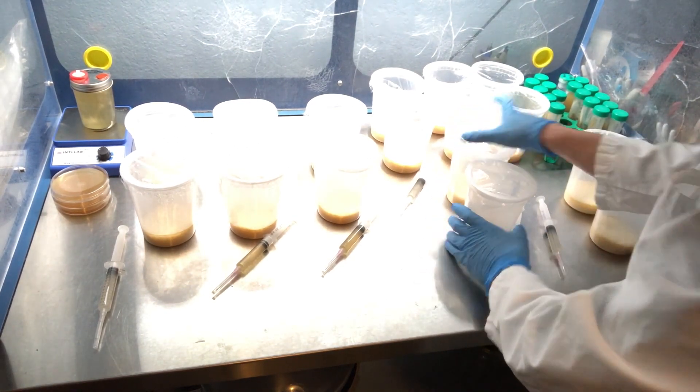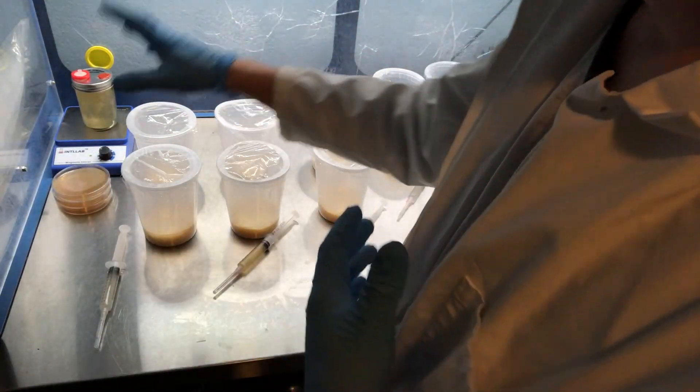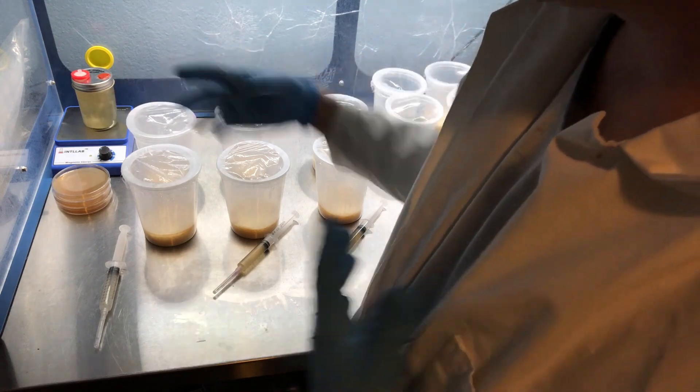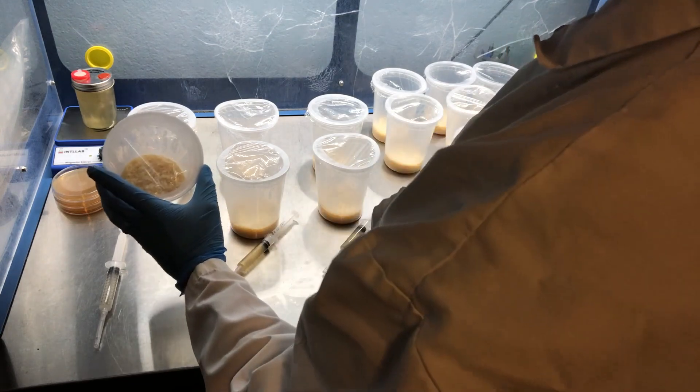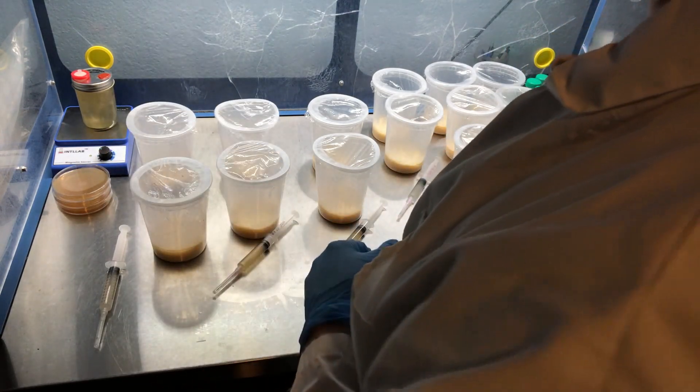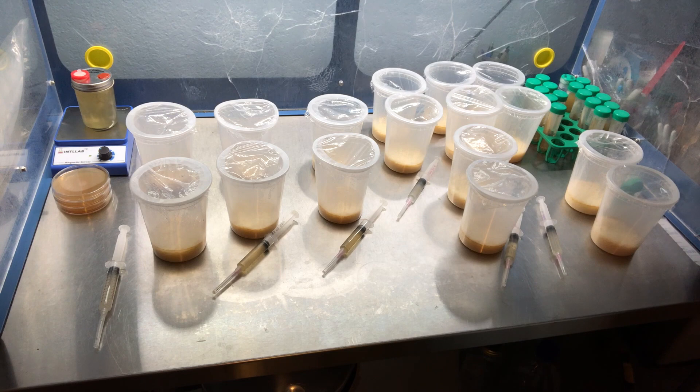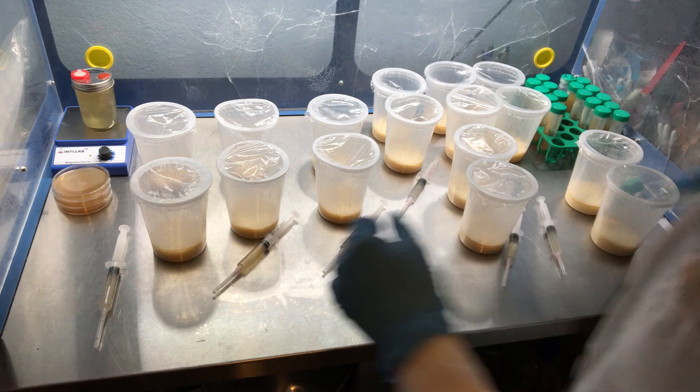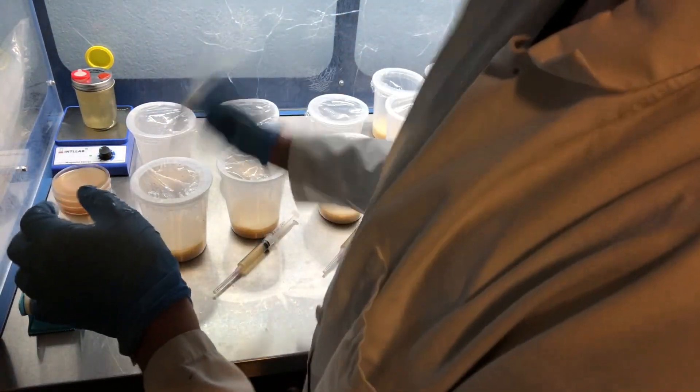You can see that these lids that I made, all I did was take saran wrap, the cling wrap, and then I parafilmed the edge so that it would stay on. I really like these because you can see through them and you can watch the colonization. But once I get the process down it won't be as much of an issue. I'm just going to also grab my micropore tape and I will start with the Terrestrial Fungi.